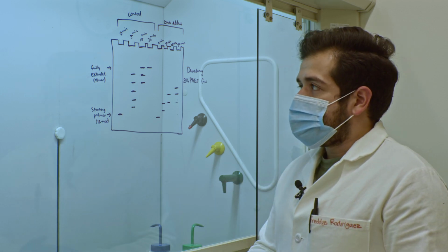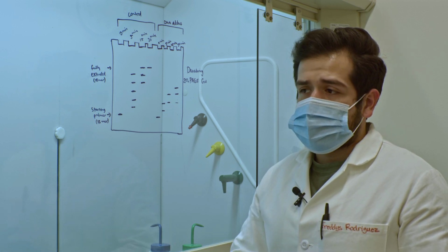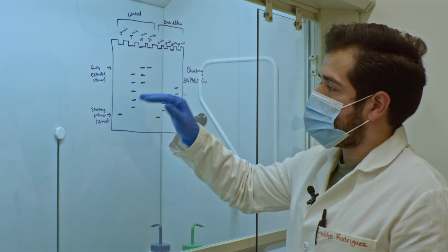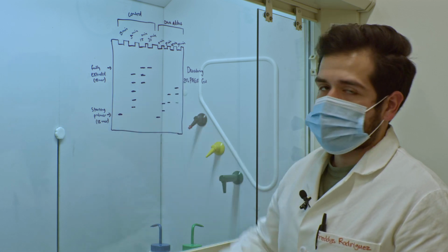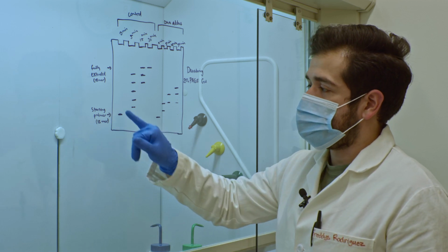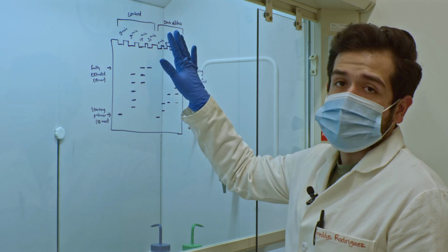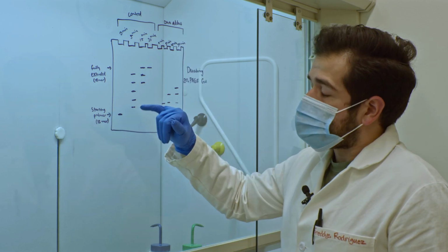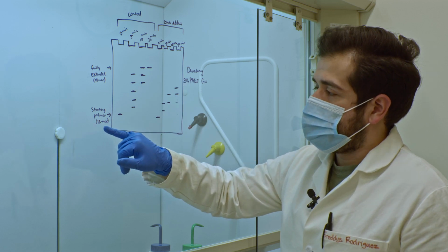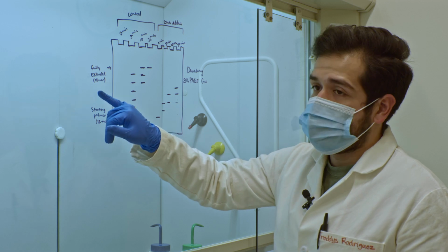This radioactive DNA, when it's mixed with its polymerase and deoxynucleotide triphosphates, or nucleotide triphosphates if you're doing things like transcription, gives a series of dark bands which represent different extension products. At the very bottom, you should always have your starting primer at time 0, whether it be a control or some sort of DNA adduct. Most of the time, you'll see that these controls fully extend. In this example, I hypothetically said this is a 12-mer. It extended all the way at 30 minutes to its 18-mer.